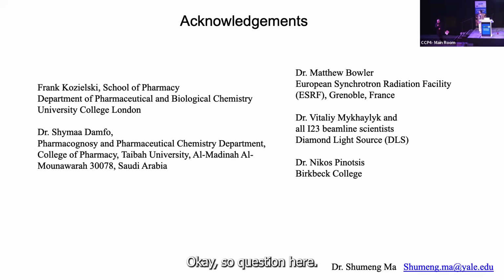Okay, question here. Thank you for your talk. I was wondering, in your radiation damage study of the iodide fragment, I'm sorry if I missed it, but what's the dose for each data set? Oh, we collected data at 9 keV consecutively from the single crystal. We collected 22 data sets from the single crystal to see how the anomalous difference map changes along this process.